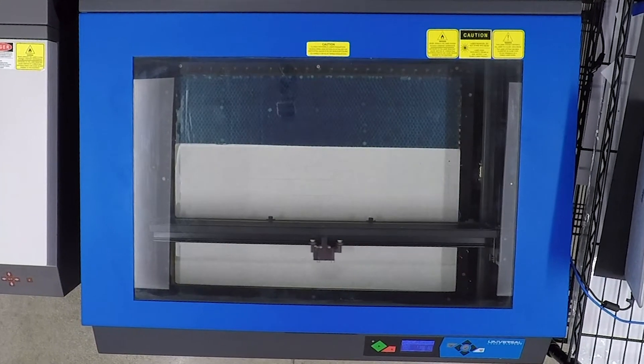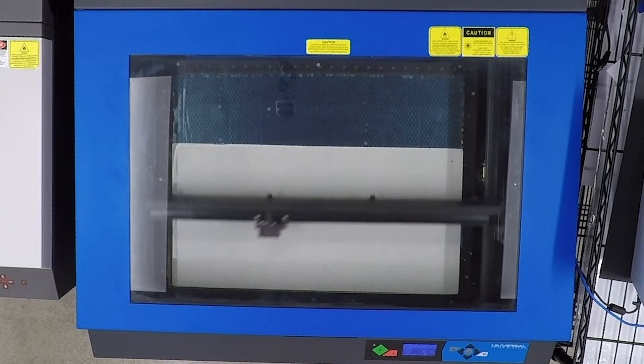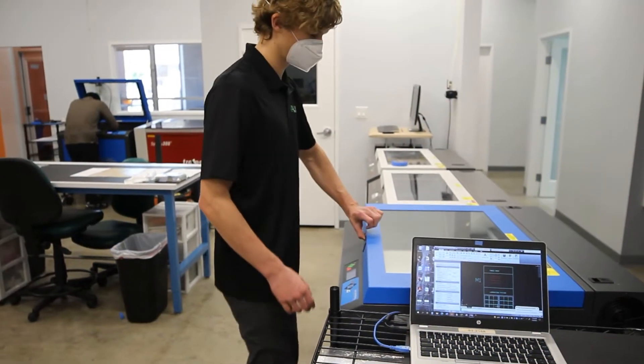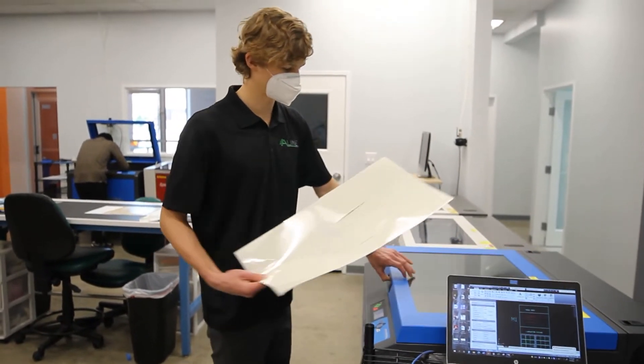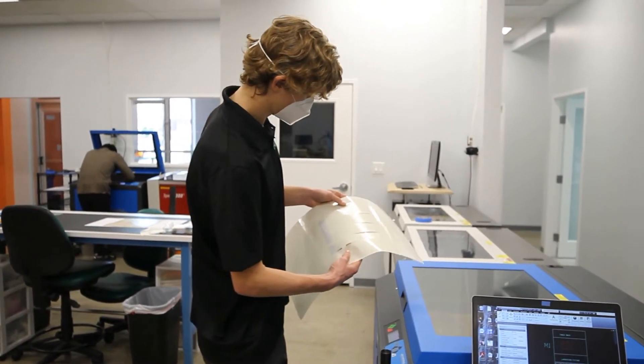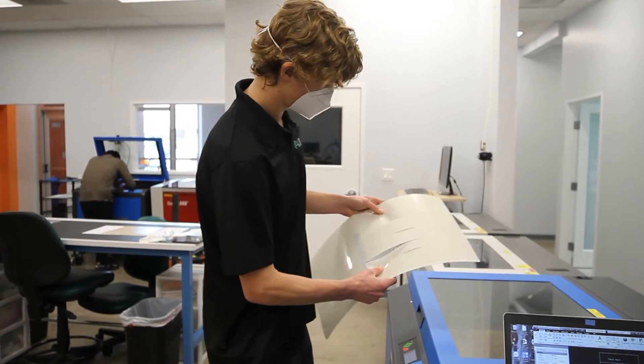Using the process of batch manufacturing at the lasers allows material to be processed by the lasers continuously, leading to little to no downtime of lasers. Along with that, multiple lasers running simultaneously assist in the efficiency of batch manufacturing.